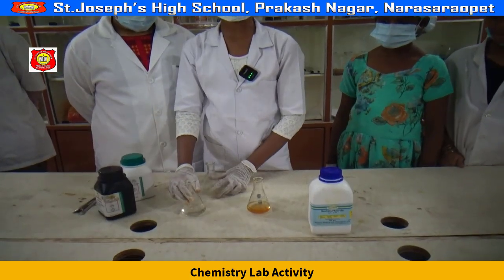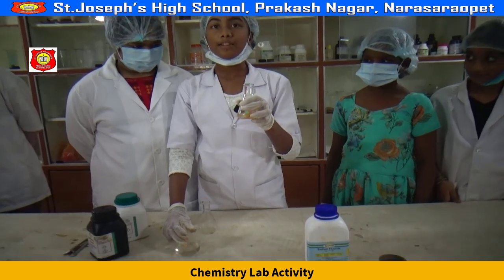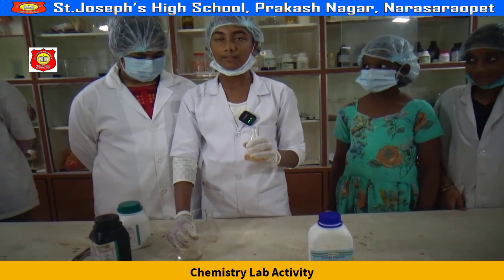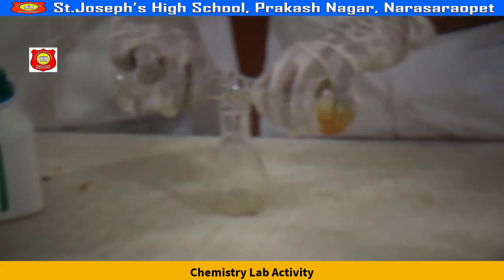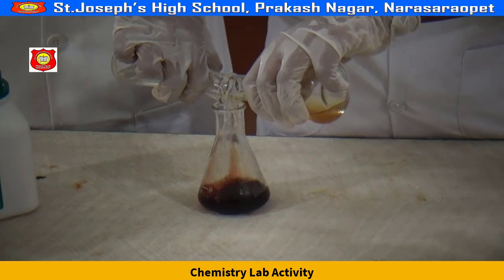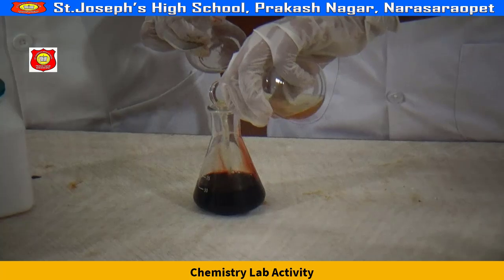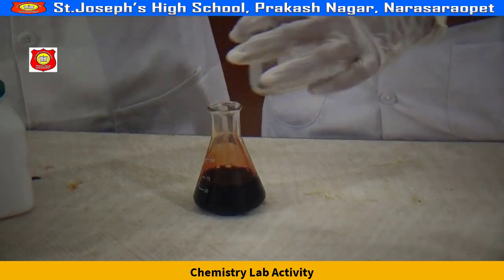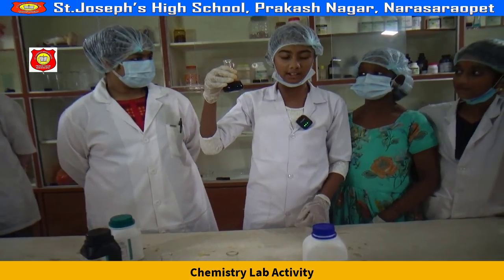Now take potassium thiocyanate and ferric chloride in one beaker. This is called fake blood, which looks like real blood.